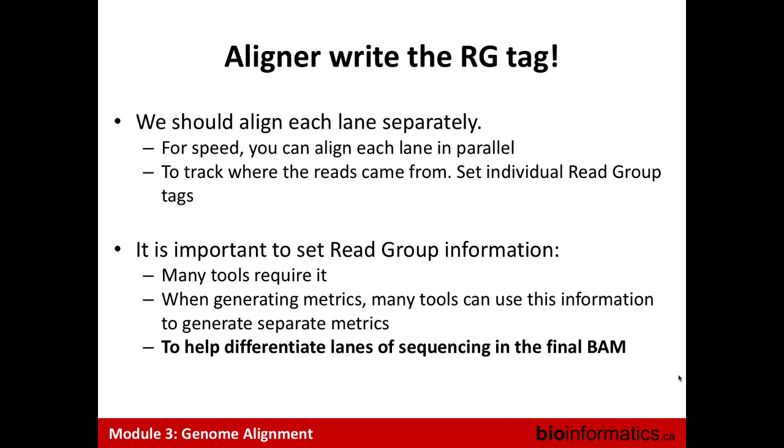But do you know beforehand how good the quality of the reference sequence is? Like if I've got a hippopotamus sample. Yeah, you can look at the contiguity. There are some metrics you can look at when you look at assembly metrics of your reference to understand. So you can look at N50. So there are some metrics, but Jared, will you talk about assembly metrics in your talk? Assembly metrics, yes, I'll definitely go there. Okay, so you will see in Jared's talk more detail about how you assess the quality of your assembly.